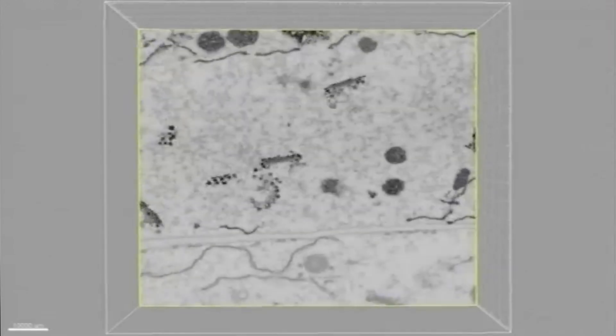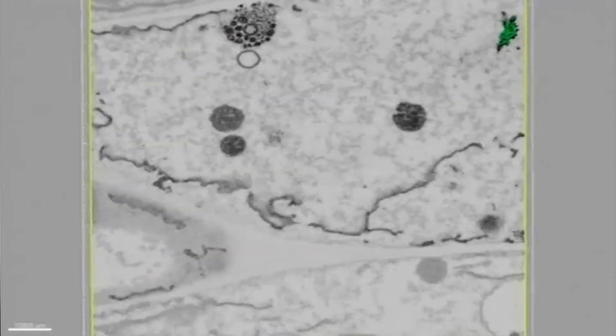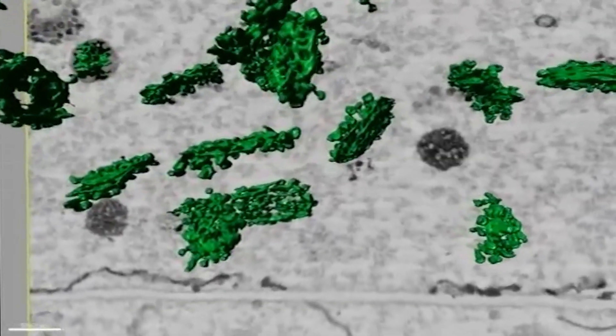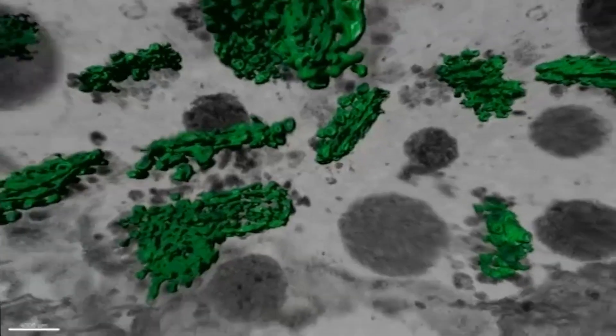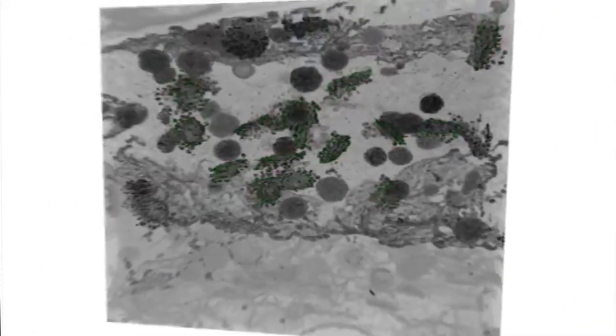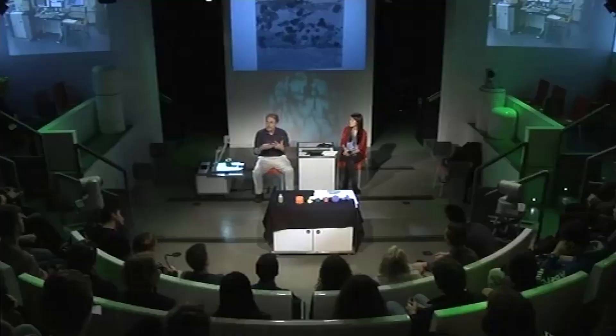The Golgi body is a little stack of membrane about a micron in diameter, and in our lab they're our favourite structure in the cell — we've spent 15 years working on them. But this is the first time we've ever been able to reconstruct them in 3D, see their position in the cell, and count them — the number in one cell compared to another. It's just reopening up the world of the cell to us. These microscopes have been around now for only about four or five years, so it's a very, very new technology.